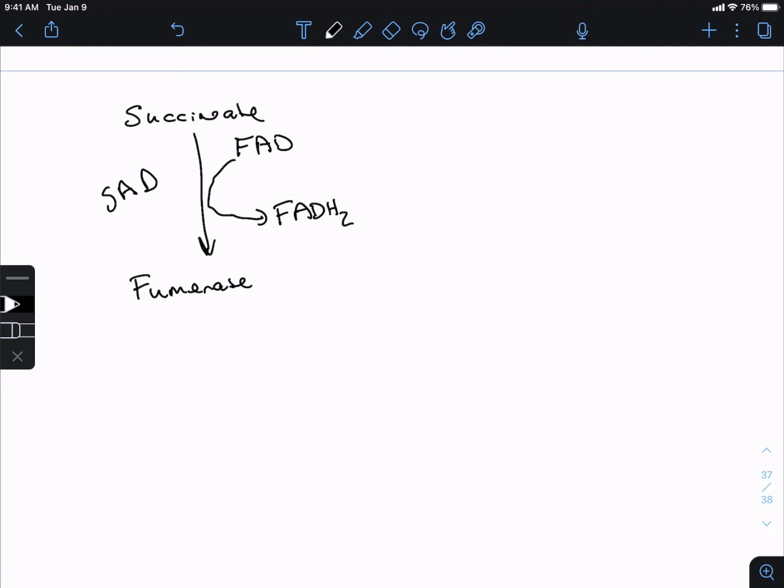We're not watching this with a microscope, and even if we were, we don't have microscopes powerful enough to see individual proteins. We have to do things like X-ray crystallography and then use microscopes. We can use X-ray diffraction, but we can't see individual proteins. We just don't have that technology yet. So since we can't see this, we need to figure out whether this reaction is working or not. We need to find some way to monitor it.